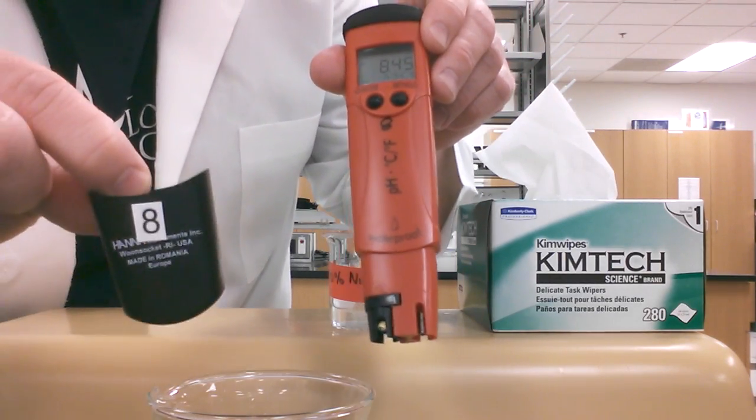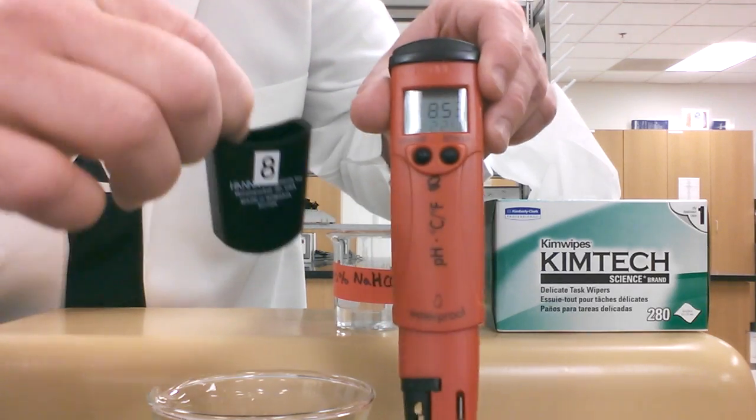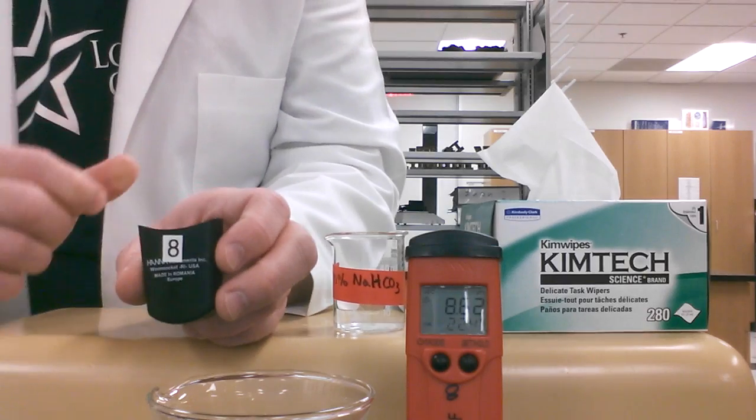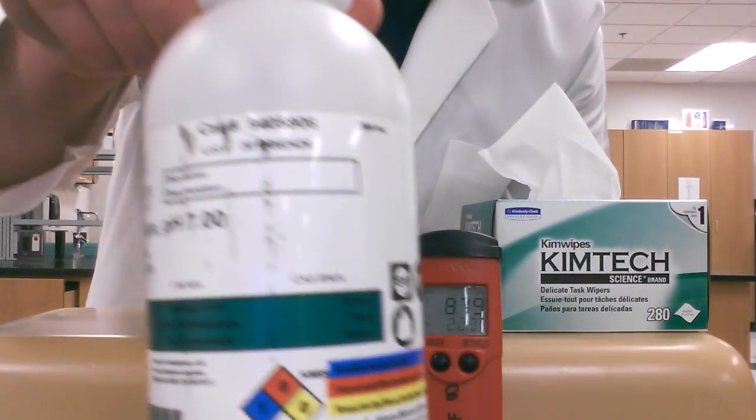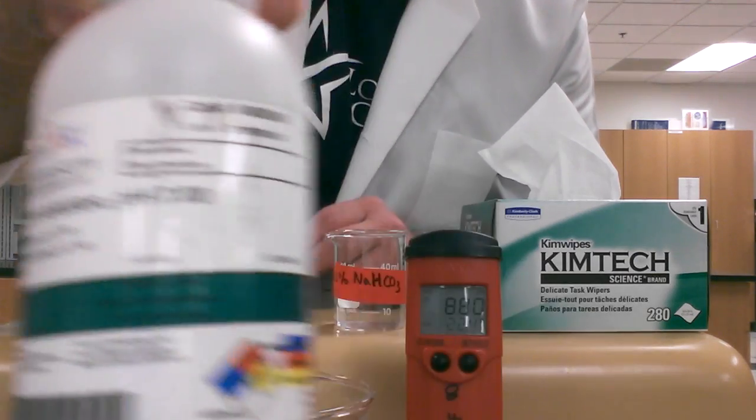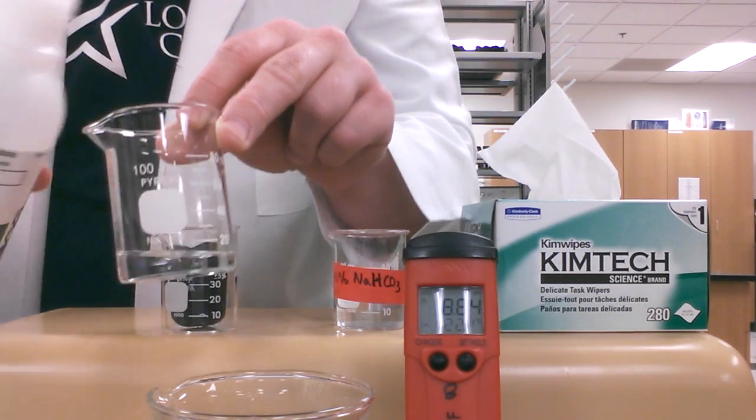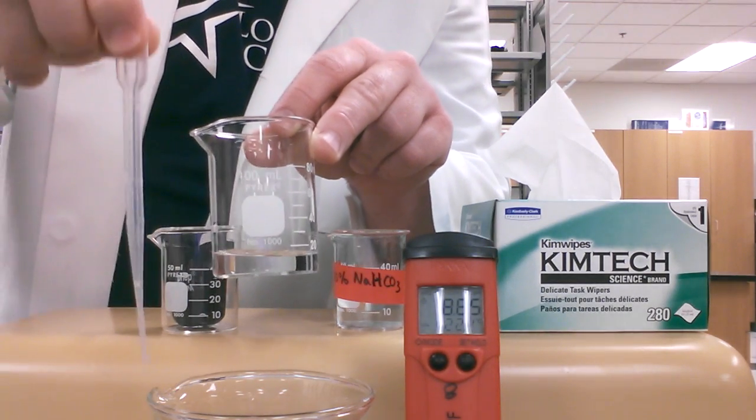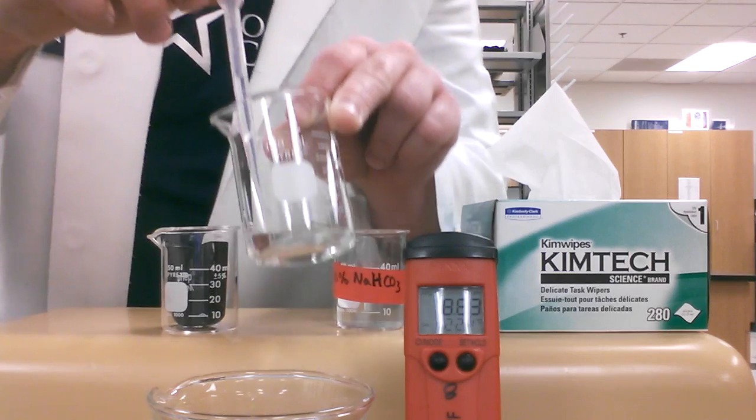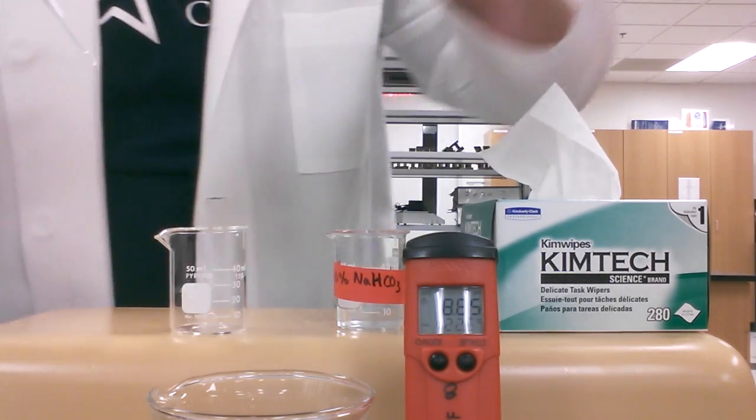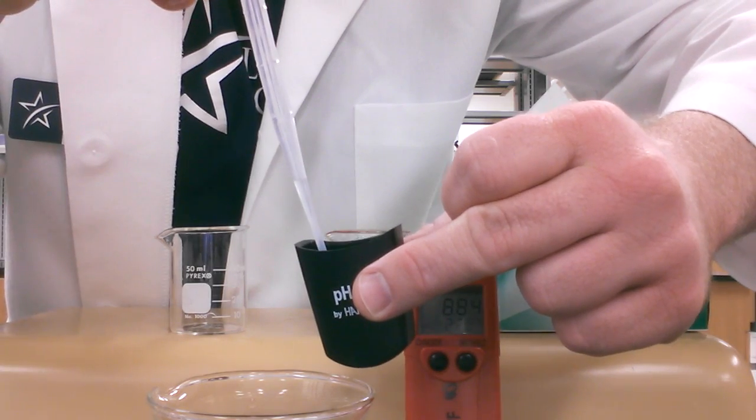When you're ready to put this back on, you're going to have to make sure that there's a buffer solution inside that cap in case we spilled any out when we were taking it off. We're going to set our pH meter to the side and take some pH 7 buffer solution. We're going to pour some into a beaker, just a little bit. After we've poured some into a beaker, we can take our plastic disposable pipette or dropper and suck some up.